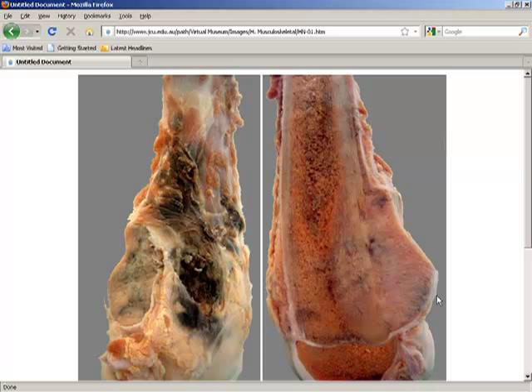And here you are seeing the tumor, and also notice that this cortex is being infiltrated by the tumor and extending into the marrow. See that area? Extending into the marrow. So this tumor is infiltrative. Although it looks well demarcated, stopped there before the epiphysis, it is infiltrating into the bone.